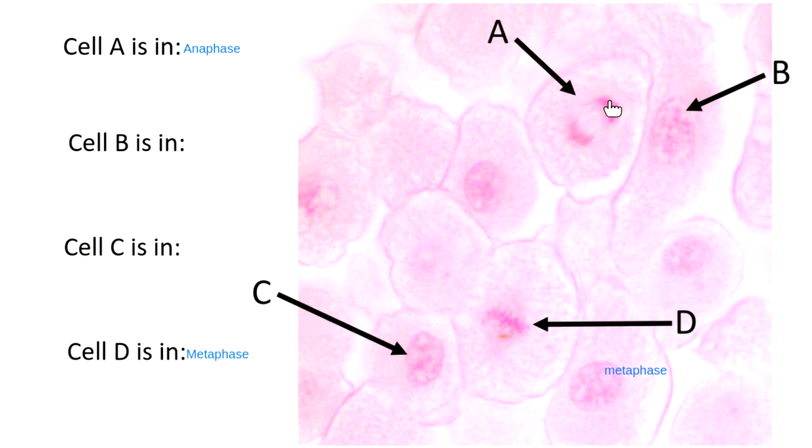Same thing with these ones here. They would just start floating, pointing in different directions. So these are still moving. In the process of anaphase, my two sets of genetic information move away from each other. So the first reason I think this is anaphase is because that genetic information is all stringing toward the middle.